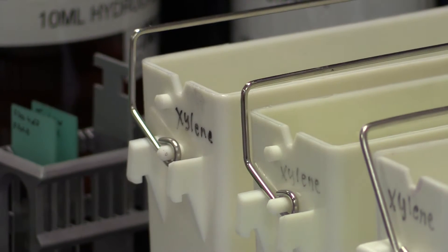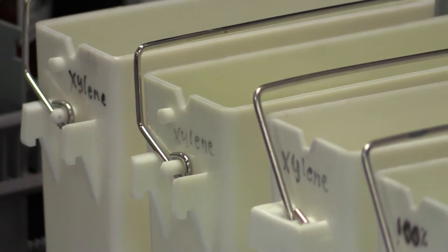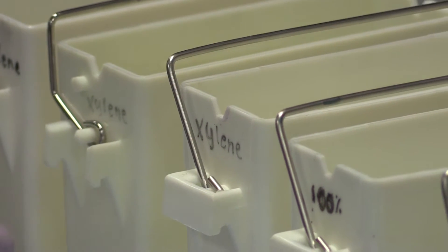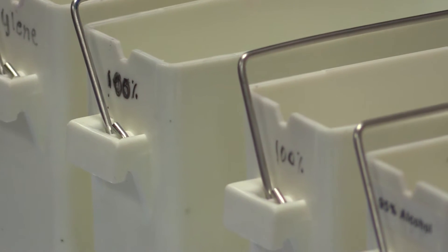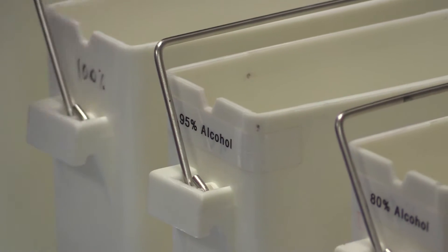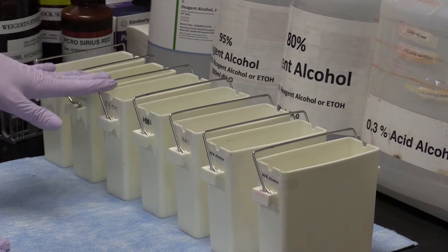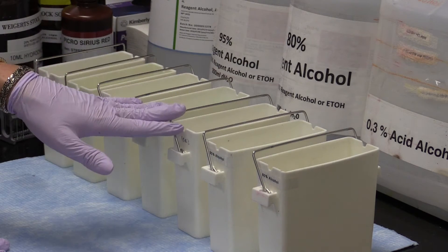This SafeClear is okay to use on the counter. Something you need to know about SafeClear is it takes a little bit longer to deparaffinize and get the paraffin out, and that deparaffinizing is a critical stage in your staining process. Then we have 100% alcohols — the purpose of the alcohols is to remove the xylene, because the xylene substitute is only miscible with 100% alcohol.